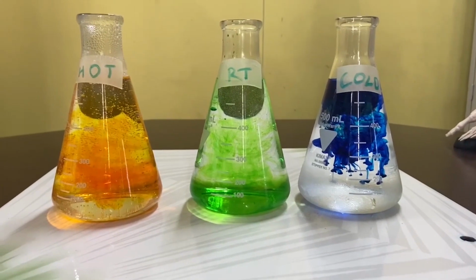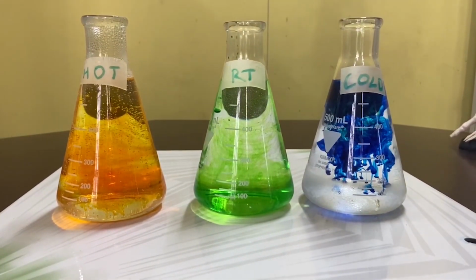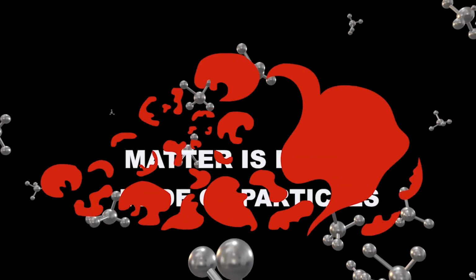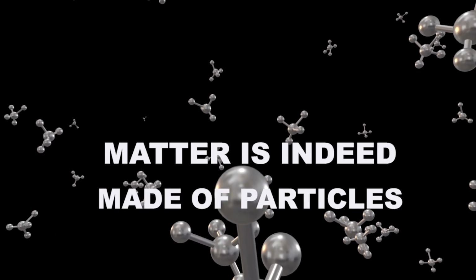As you can see, the flask containing the hot water changed the quickest, while in the flask containing the cold water, diffusion is still taking place. Now, what did this prove? This proves that matter is indeed made of particles in constant motion.